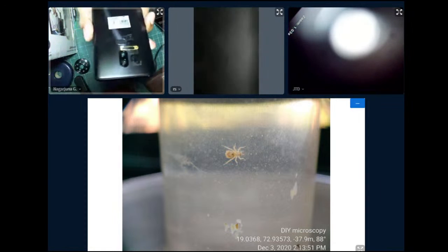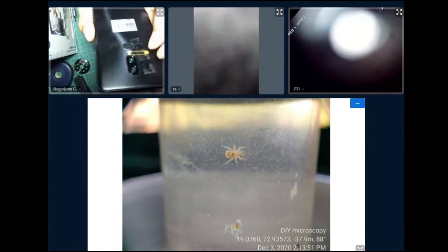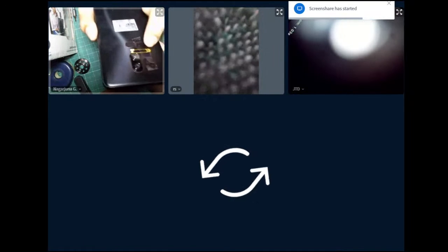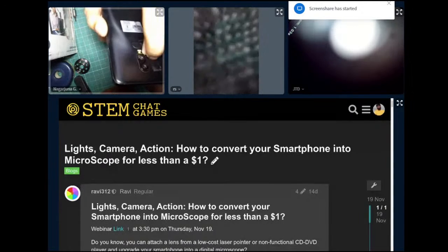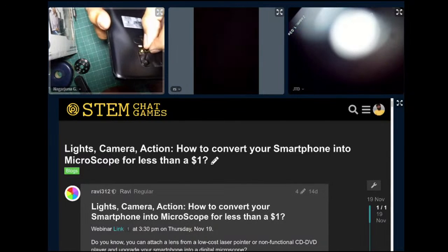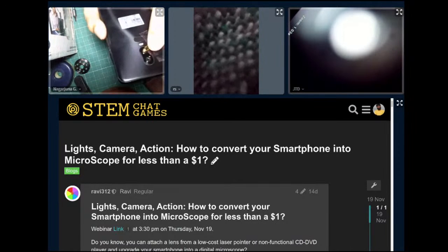So can you see something that I am showing? Yeah. Okay. You can see that. So I have used a safety pin, and in that safety pin, I have arranged one glass bead. Oh, this magnification is fantastic.